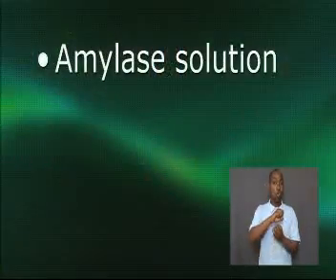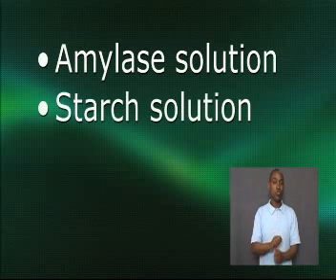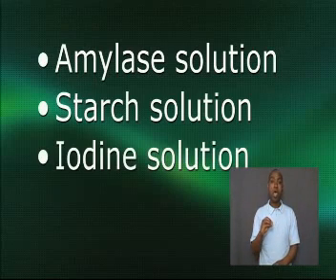This reaction can be observed in an experiment to indicate how quickly enzymes work. This experiment requires 3 solutions: an amylase solution, a starch solution, and an iodine solution.